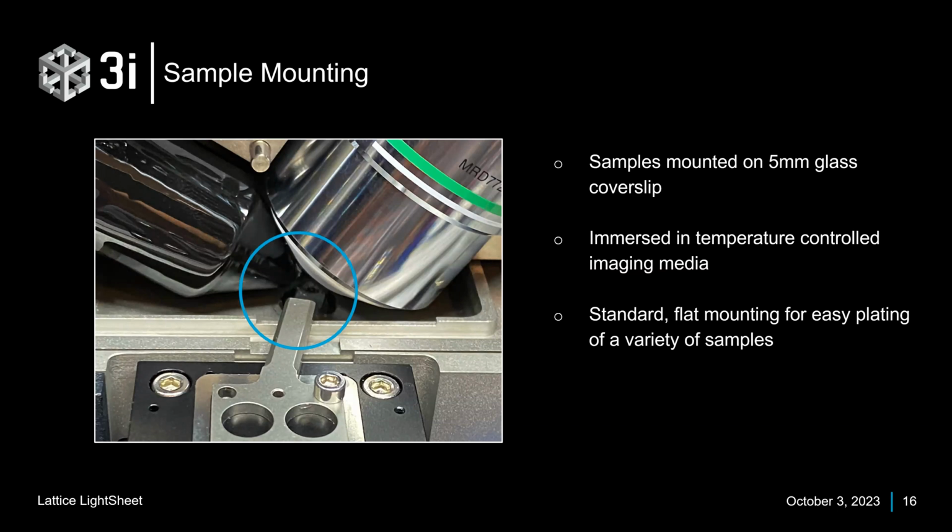There is an objective below through another glass cover slip. So for somewhat easier sample finding, usually again for larger samples like embryos, cells, you really don't need that. But if you're never going to use that, you can use whatever you want for the sample holder. I was just imaging adult C. elegans with a group recently that we printed. They're about 50, 75 micron wide channels to orient the worms in the exact same orientation every time we image them. So it wasn't up to them and how quickly they put them in the little agarose bubble to keep them straight. It was, okay, well, if you line them all up ahead of time, we know where they are. It makes it a lot easier.